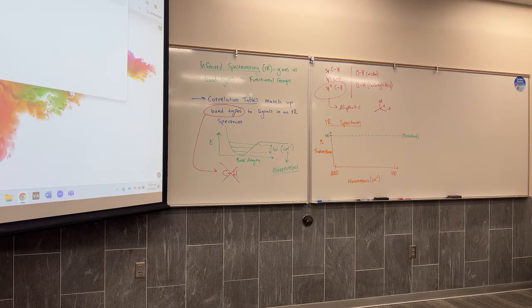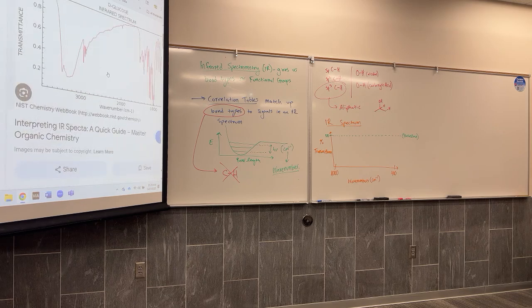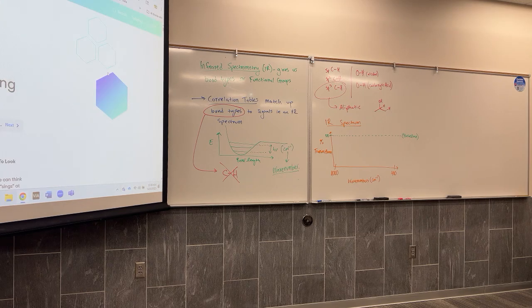What's interesting is that if you run an IR spectrometer with nothing on it, you do not see baseline. Instead, you see something like this.